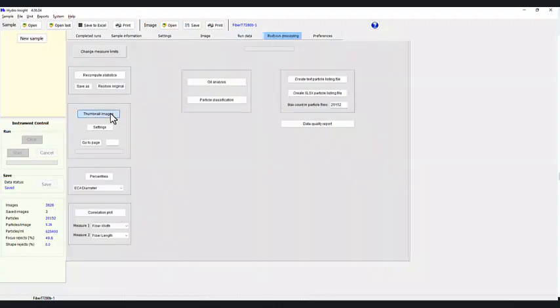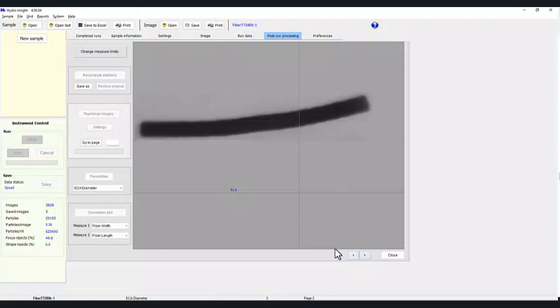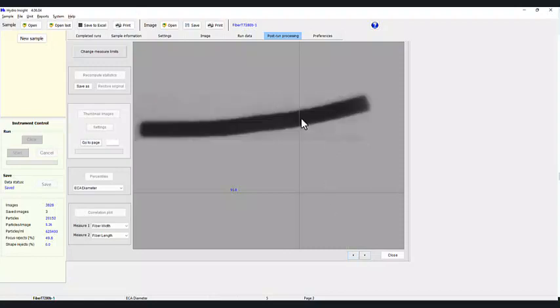Again, one of the first things that people generally tend to do is look at the thumbnail images, although there's so much more to it than just looking at thumbnails. That's actually a contaminated particle. As you can see, all these glass fibers are somewhat translucent, but all of a sudden we see this one, probably a carryover from the previous sample of the zirconia that was in there.